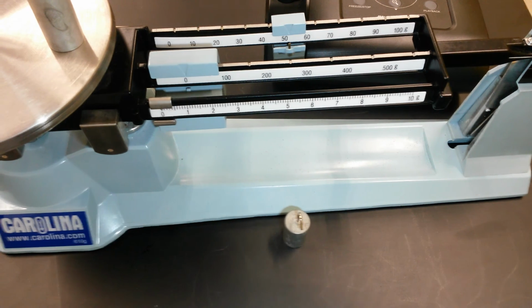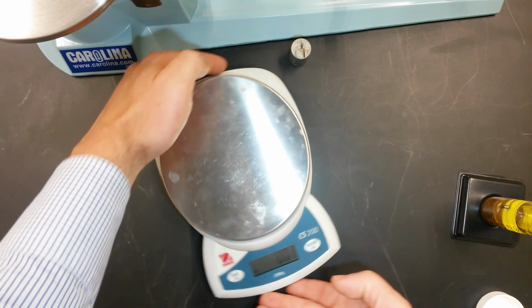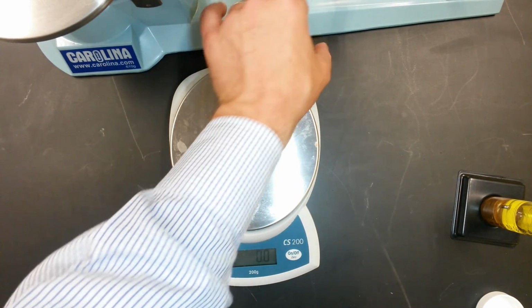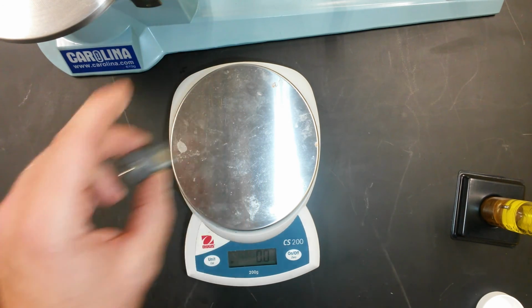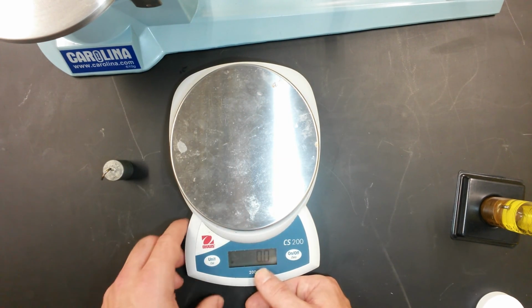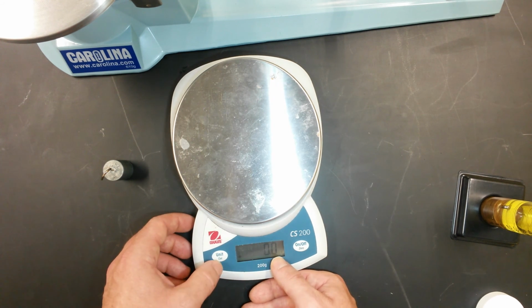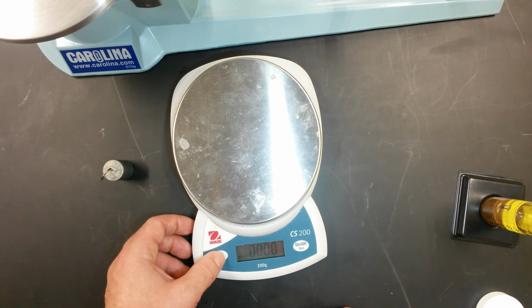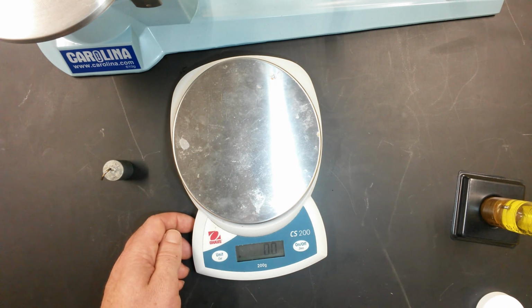Some of you, rather than a triple beam balance, will use a much easier balance to work with, which is the digital scale. The digital scale simply is set to 0, and I just take the object and place it on top. Once I do that, you'll see that the measurement comes up. Make sure that your scale is set to grams. You should see a G here. If you hit the units button, you can switch it to ounces, newtons, and then back to grams. And we're going to be measuring the mass in grams because that's the metric base unit.